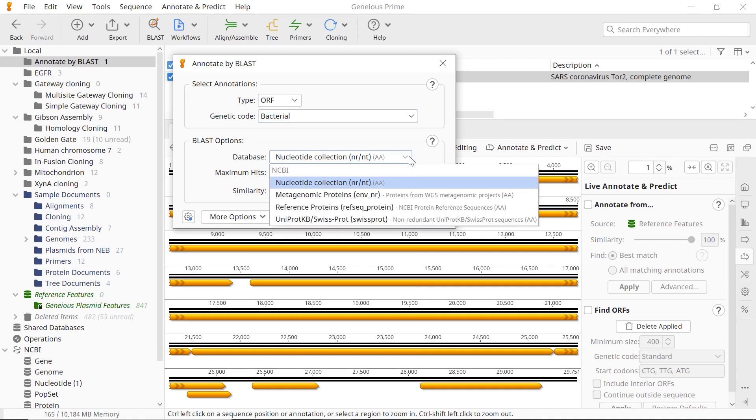Then choose the appropriate database in the BLAST options field. Only amino acid databases can be selected, as BLAST will find the matches for your annotations.